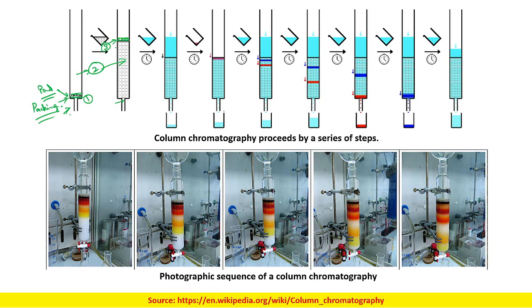Once you do this, the solvent layer is added such that you collect some of the solvent beneath it, and the whole of your column is filled with the solvent. This step is called solvation.